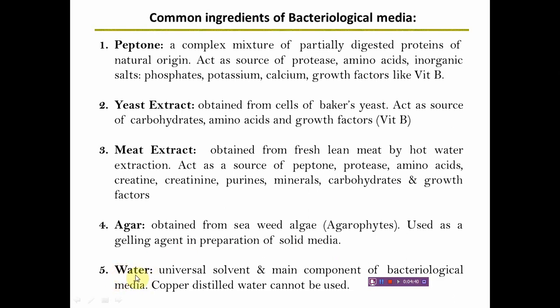Another important constituent of bacteriological culture medium is water. Almost all media are prepared in water. Water is a universal solvent for all other things, and it is the main component of bacteriological culture medium, as microbial cells, bacteria not an exception, cannot grow without water. Water, that moisture, is essential for their growth and for their metabolic activity.